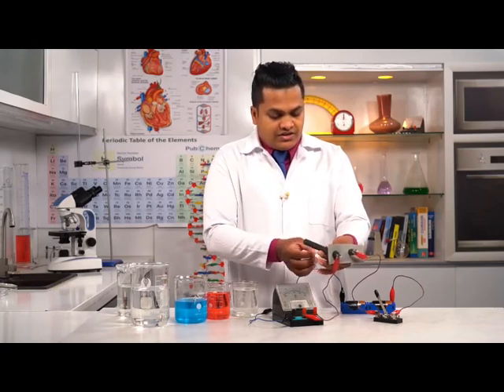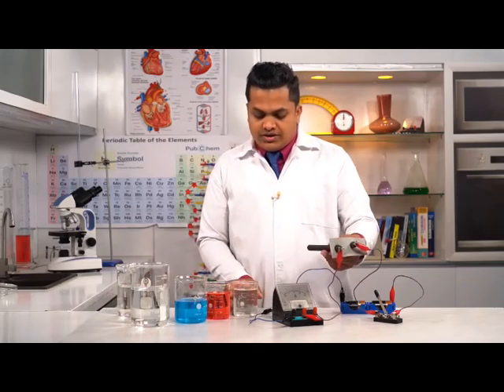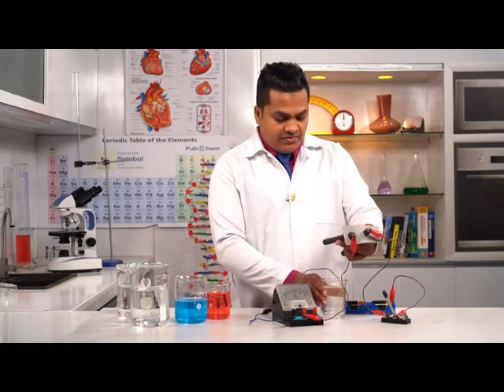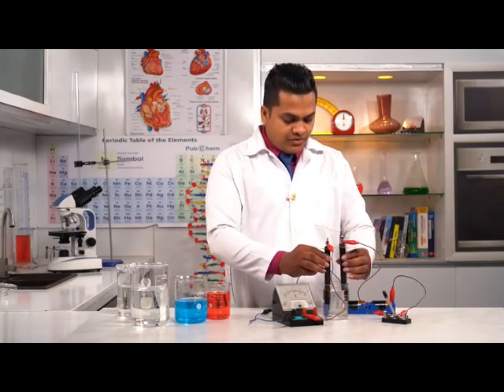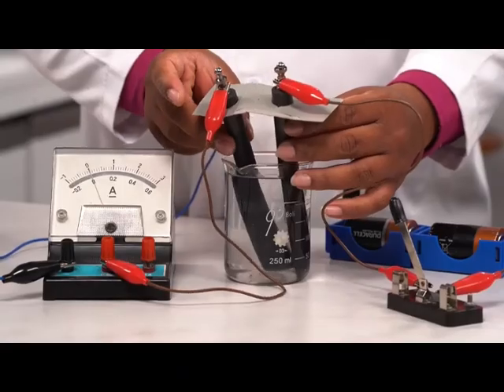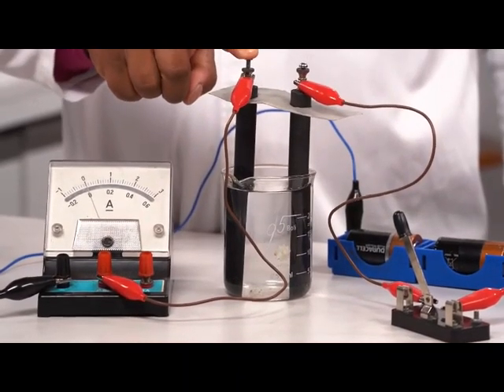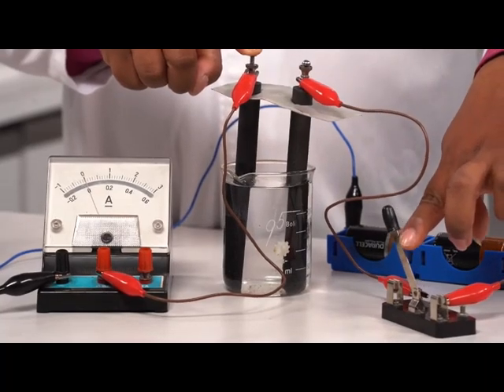So the second solution over here is the salt solution. I will keep the salt solution over here. Let's dip the two carbon rods. It's important to keep these two rods away from each other so that they will not contact each other. It's important to do that. Now let's turn on the switch and observe.